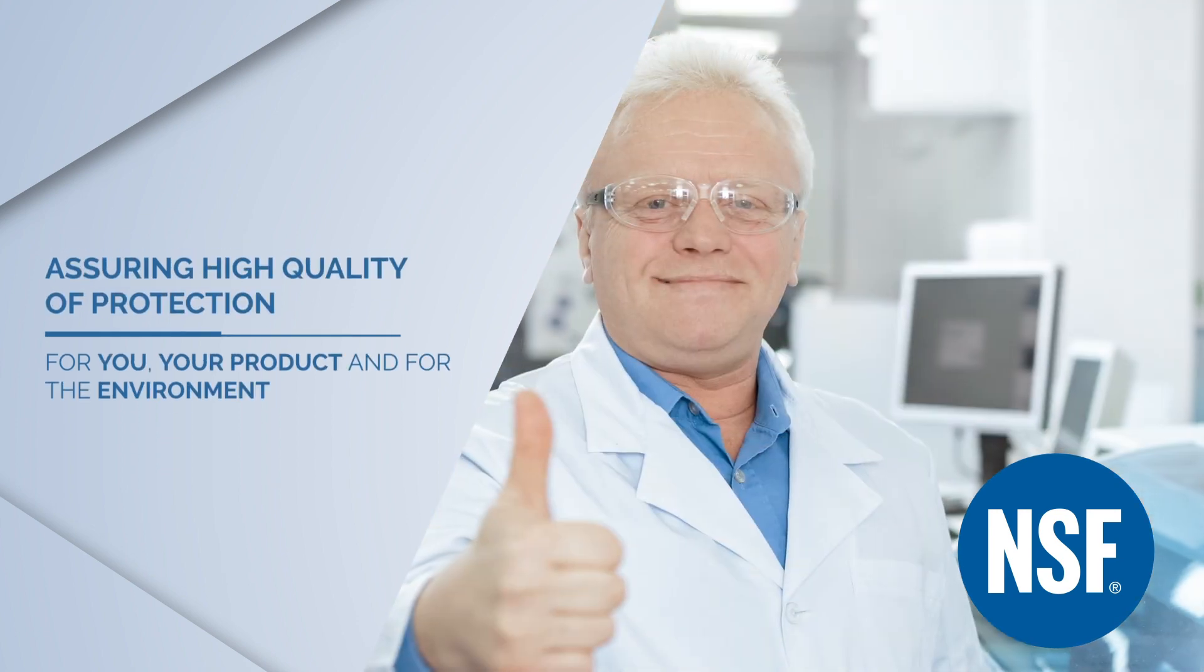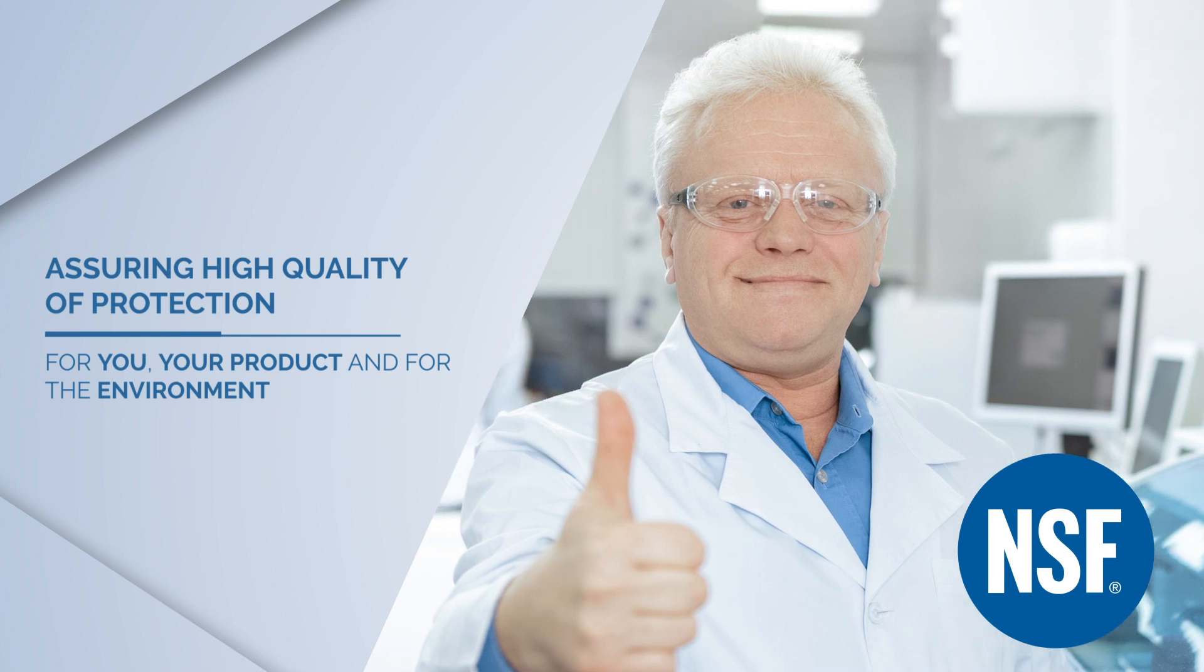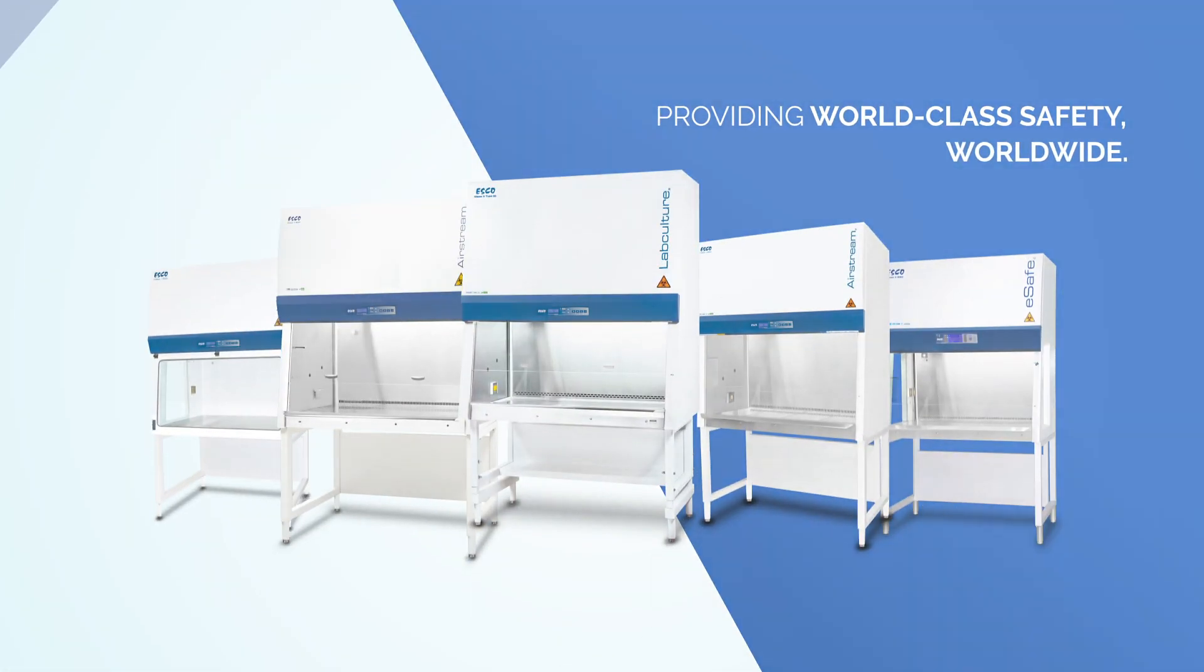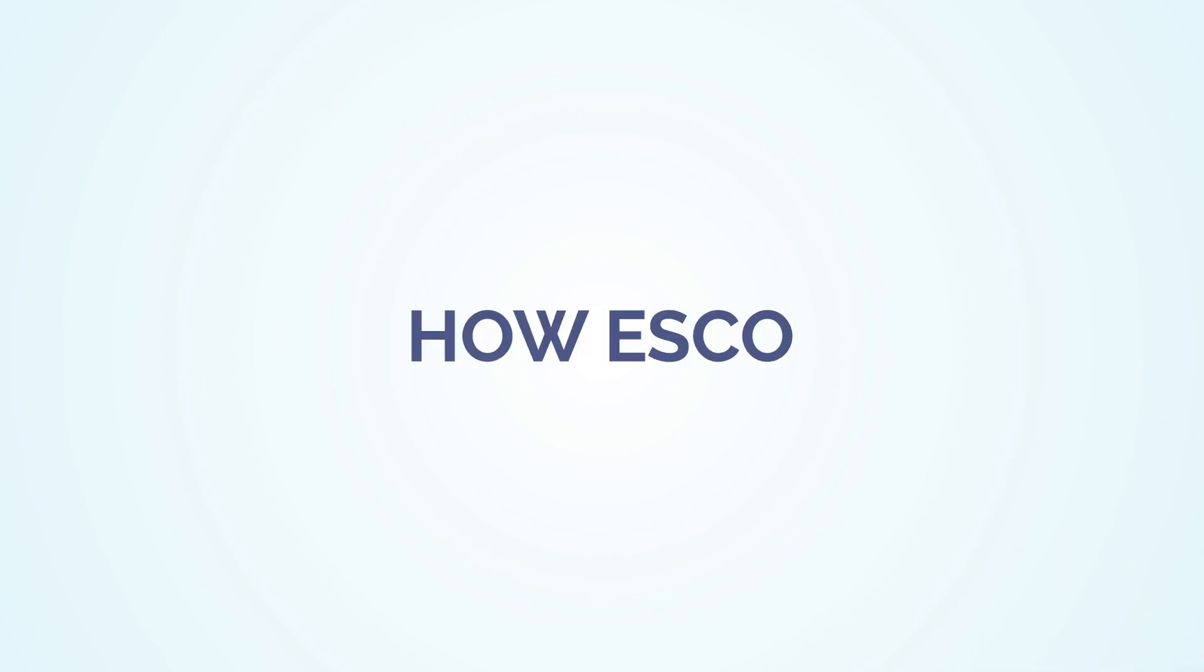Assuring high quality of protection for you, your product, and for the environment. Providing world-class safety worldwide. Ask us how Esco Biological Safety Cabinets can be part of your laboratory.